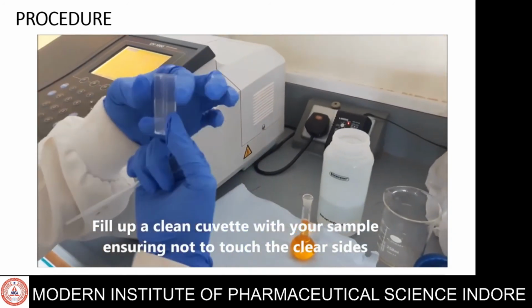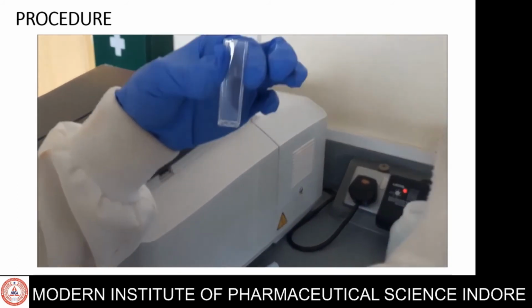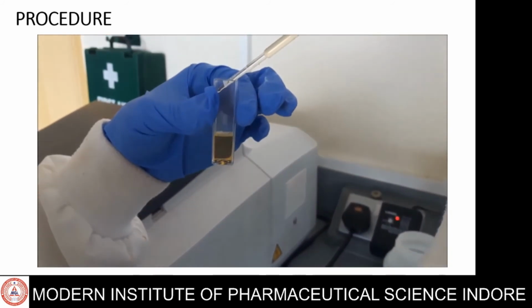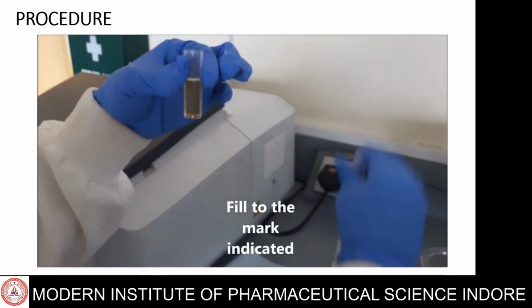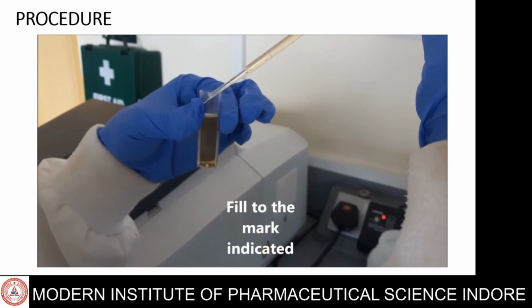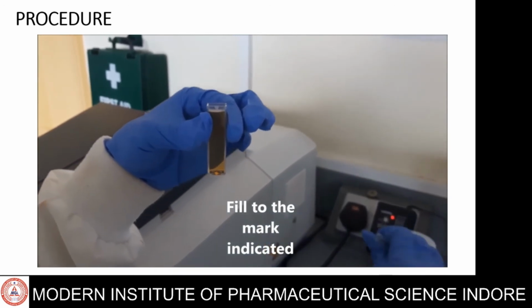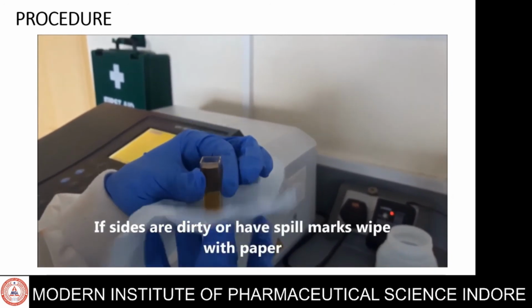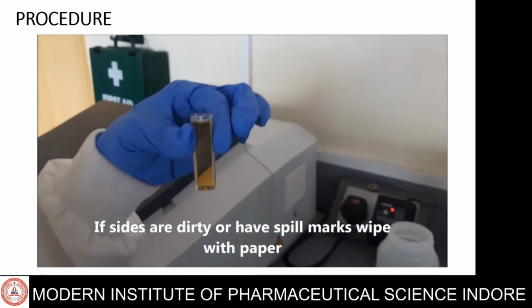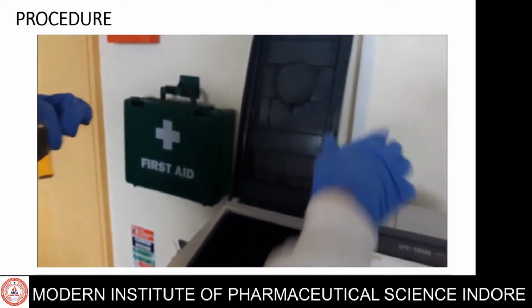Now, the sample is taken. Fill up the cuvette with your sample, ensuring not to touch the clear surface. Fill up to the mark which is indicated. If sides are dirty or have a spill, wipe with paper.